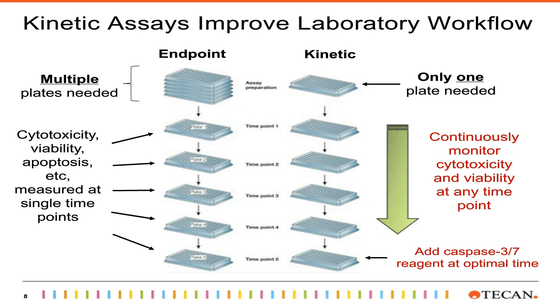Typical biomarker detection assays are endpoint and lytic in nature. So once you add that reagent to your test plate, those samples can no longer be used. What we're showing here on the left-hand side of the screen is an example of what you would have to do if you were setting up a time course experiment for these traditional endpoint assays. You have to set up multiple plates, multiple copies, and assay at very different time points to achieve your ultimate time course evaluation of that compound.